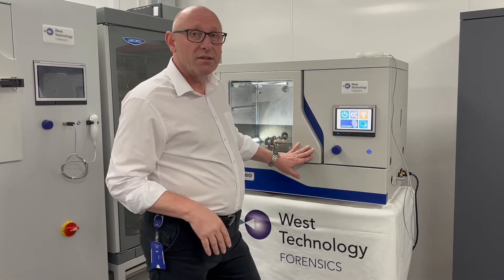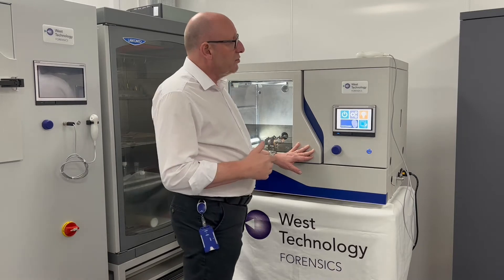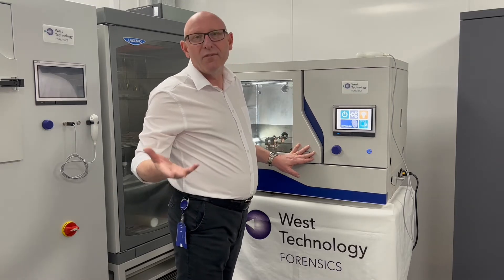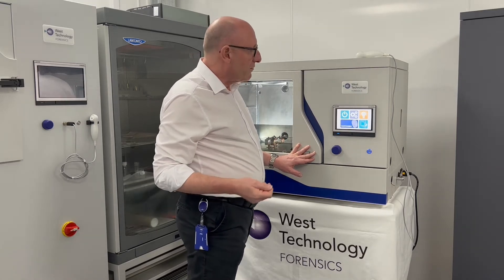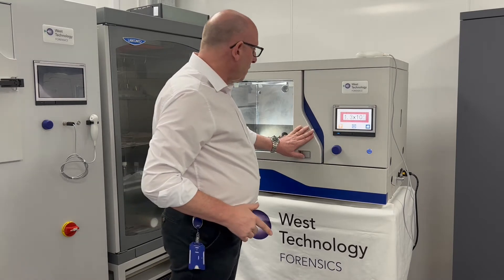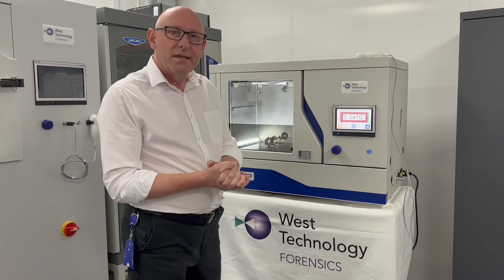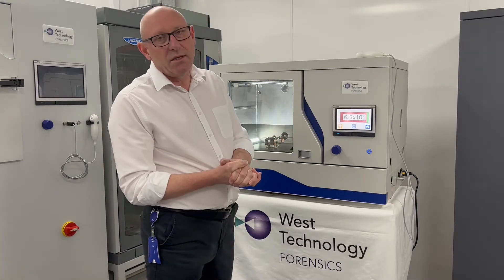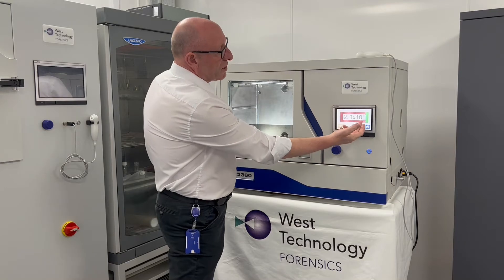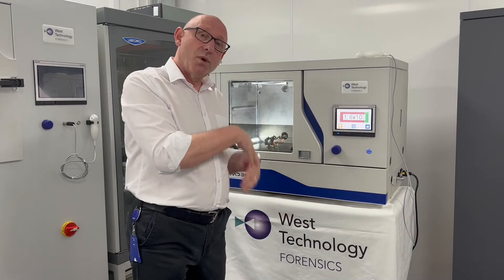What I'm going to do now is start the process. To do that I use the control screen which is made up of icons, so it's very easy to use and very familiar to people that have a smartphone. I'm going to press the processing button and it will start the process. Immediately it goes to a vacuum gauge screen so that you can see the process working. As the vacuum improves, the screen changes colour from red to green.